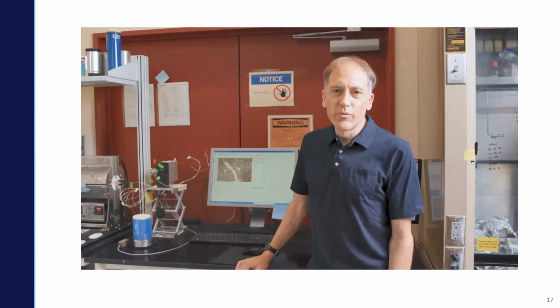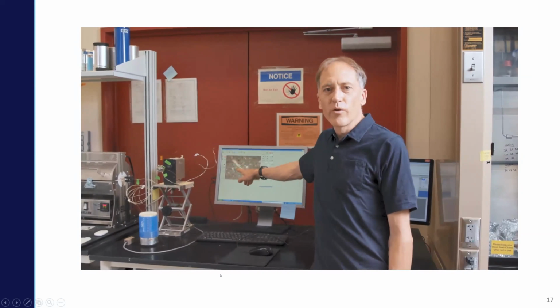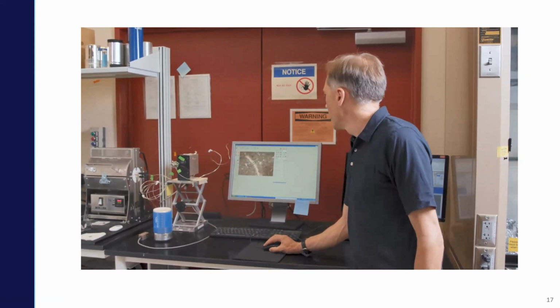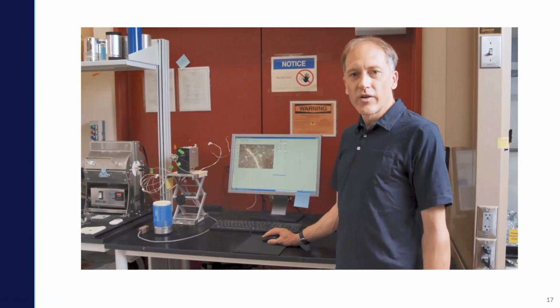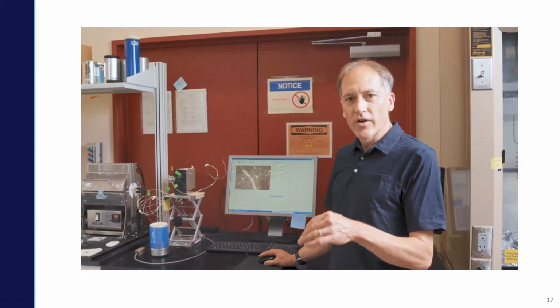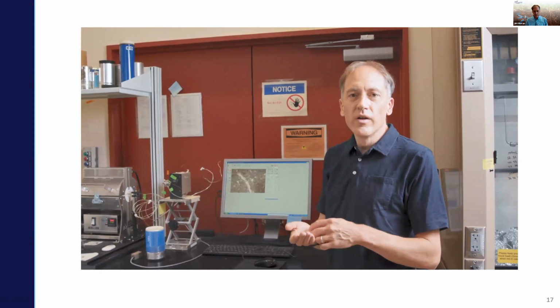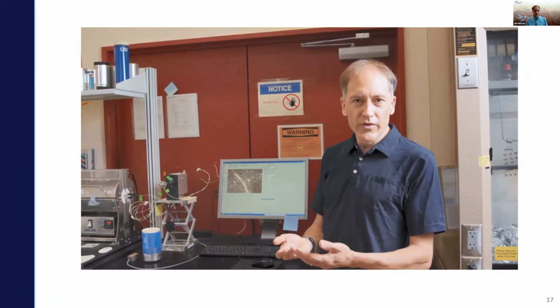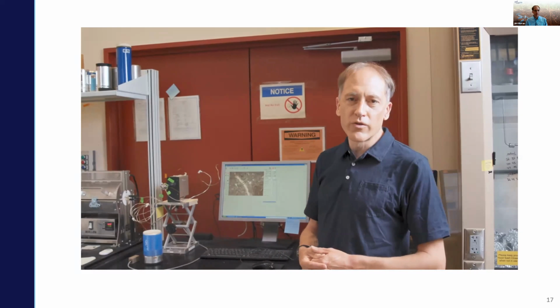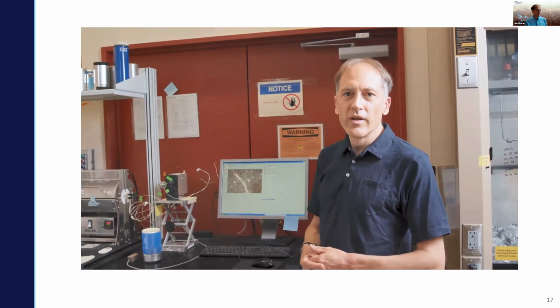What the laser ablation system allows us to do is target a specific location within a sample that we want to take a subsample. In this case, I'll put a target right here. We can then turn the laser on, and what it's going to do is flash a number of pulses right at the surface of that sample in that targeted location. That's going to remove little small pieces of that surface of the sample. We're going to entrain that in helium, combust any organic carbon in that sample to CO2, and then pass it to an isotope ratio mass spectrometer for highly precise quantification of how much 13C is in that sample. Let's take a closer look.